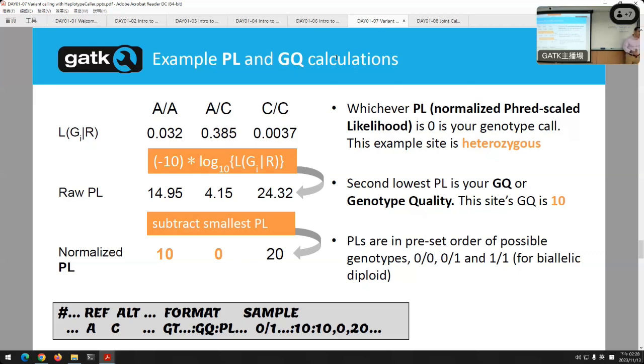It all depends on what you're doing. If you're looking at de novo mutations, so changes that are different from a child to parent, you only expect 20 of them in the whole genome. So if it's below Q60, probably don't trust it. If you're looking at whether it's a homozygous reference or not, Q30, Q40 is fine. It really depends. What most people do is they set a cutoff of around Q40. That's still pretty good. But again, for most of the sites, most of the genotypes will be Q99. Good question. Other questions?